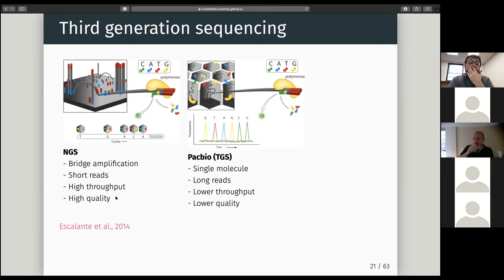One important thing that people usually underestimate is the amplification process. So Illumina has an amplification process, not only when you make a library and you amplify your library, but also just before sequencing, they call it clustering. So essentially, a library is a small molecule, and the camera cannot really take a picture or record the sequencing process of one single molecule on an Illumina flow cell. So it needs to amplify the signal somehow.